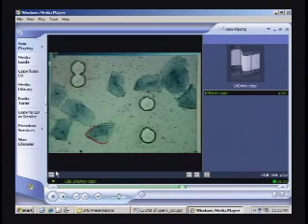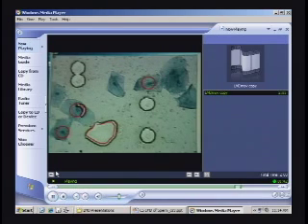So in my homemade video, once again, here's an example of, if you actually want to collect the whole cell body of an epithelial cell, you can. Somehow it skipped over the sperm one. We can go back. This is about the speed of the old instrument, and this is in real time. The new instrument you will be working on is actually much faster, which is great. And you can see it's cutting through. It's going through the slide, cutting around the membrane, and you'll see the sample drop and go into the tube. And in this next example, I'm just cutting the nuclear material.